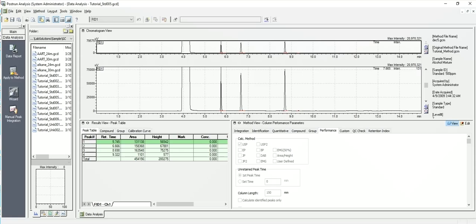So you may want to inject a second time. Okay, so once we have this part of the method all worked out, then we can get back, go back over and create a batch run. So I'm going to discontinue this portion for now and we're going to go back into real-time analysis and determine how we would make a batch run.